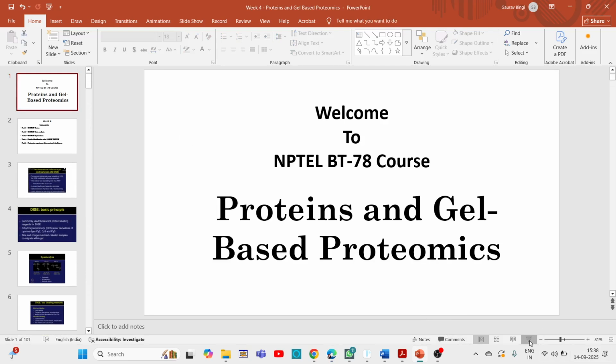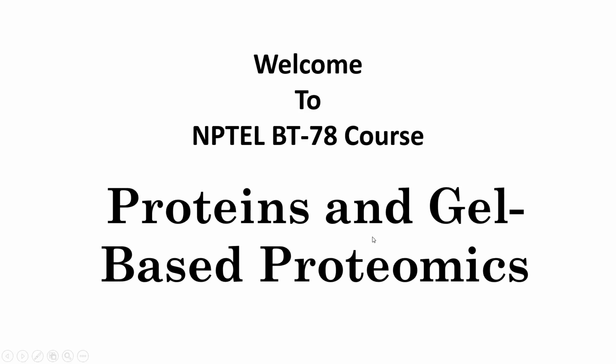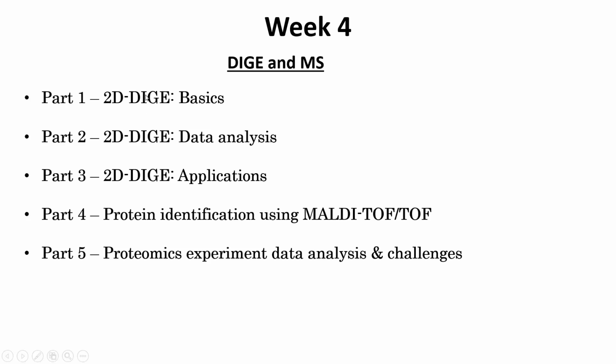So it is also similar to that of 2DE, but here we are using 3 different dyes. In terms of week 4, the other gel-based proteomics technique was discussed, which is DIGE, then further identification using mass spec, using MALDI-TOF as a detector.